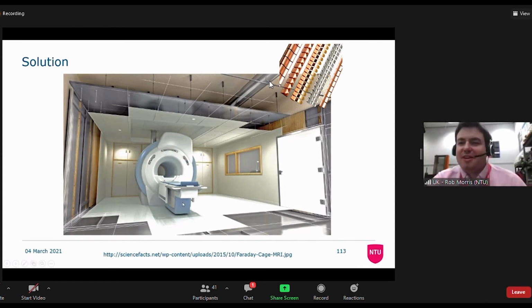It gets installed when you have your scanner installed, but there's lots of closing of doors and sitting away from it, and it's sometimes nice to just sit with your benchtop instrument and dip samples in and take them out and be connected with it rather than isolated from it in another room whilst it runs. So that's one of its problems.